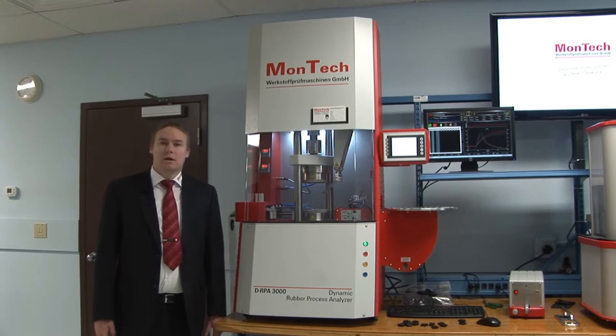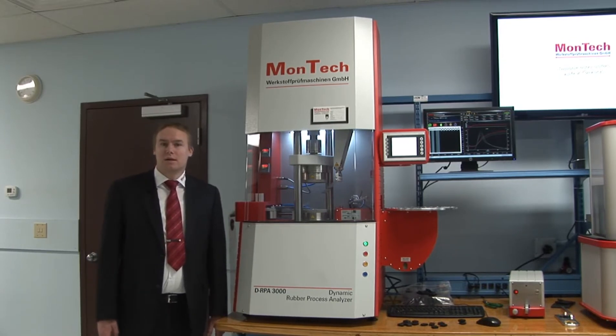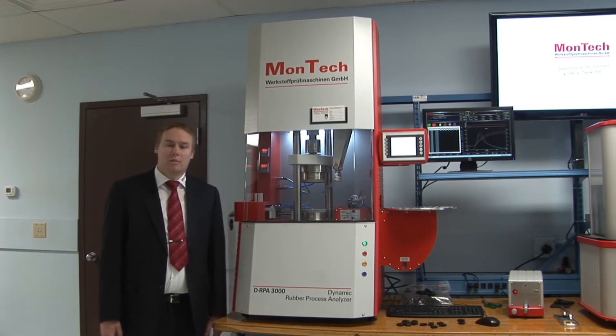The DRPA 3000 is a dynamical rubber process analyzer used for characterizing polymers, uncured rubber, measurement of curing, as well as dynamic mechanical analysis of cured rubber compounds.